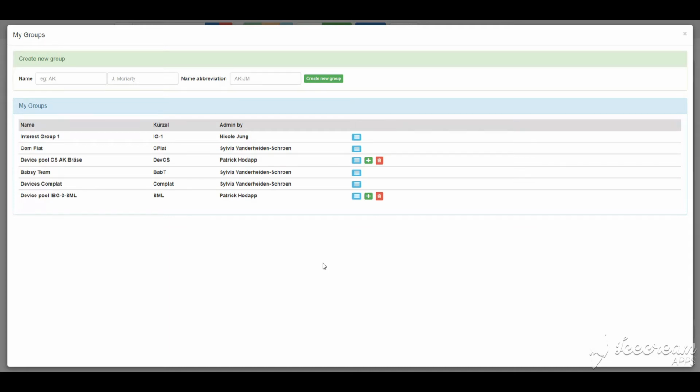to see that. This is also the way that you can share devices, or that devices are integrated into the ELN. The device list is created as a group, and everybody added to that group will have access to this device. However, we will look at the analytical device integration at the very end of this video.